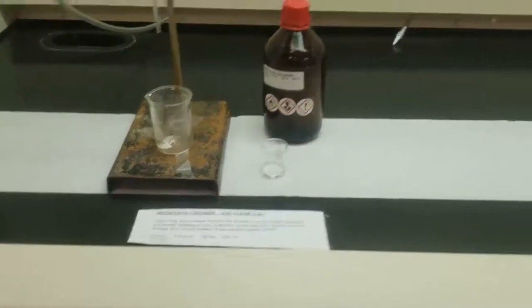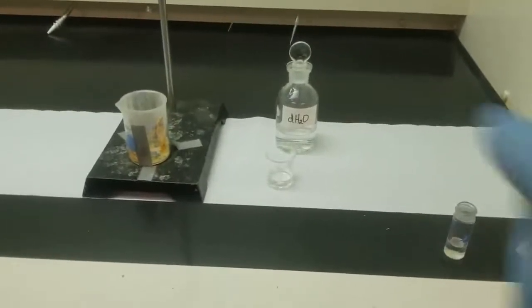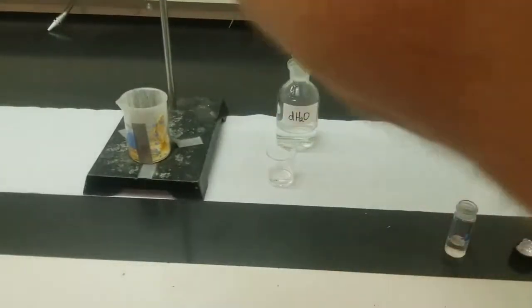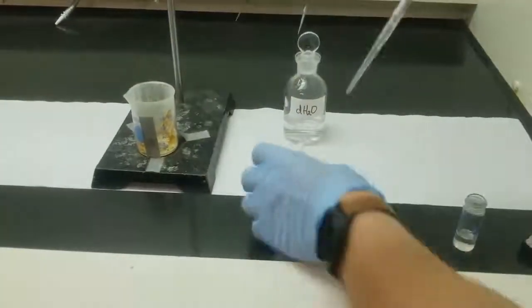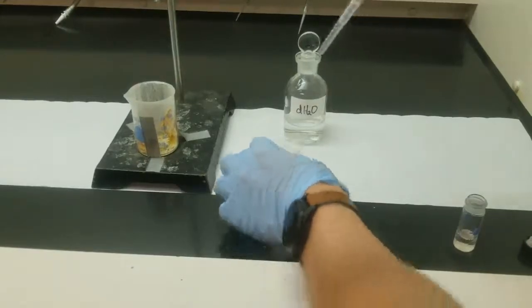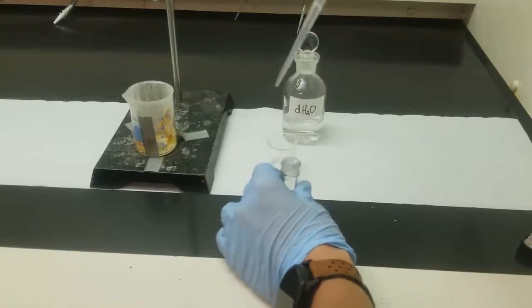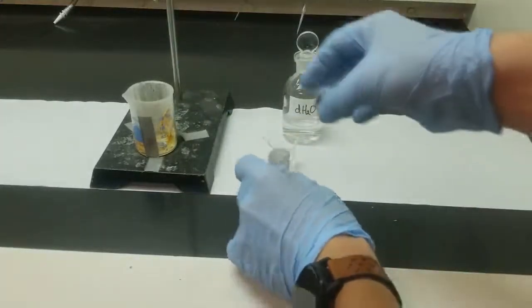And then we'll simply shift over and do the same with 600 microliters of water. Add it to our conical vial. And then put our cap back on.